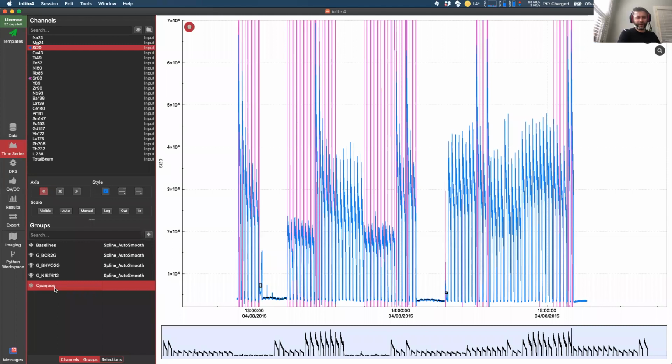It's really hard to think of icons for these sorts of concepts. That was the best we came up with. But you can also see that there are no splines for our samples. That's because it doesn't make sense to spline your unknowns. But we have splines for each of these. And we also have our spline types over here.